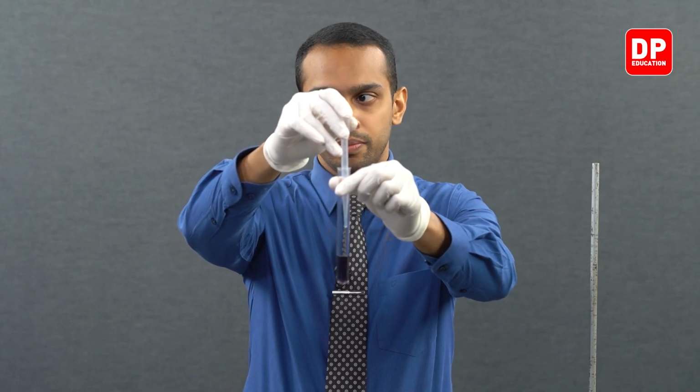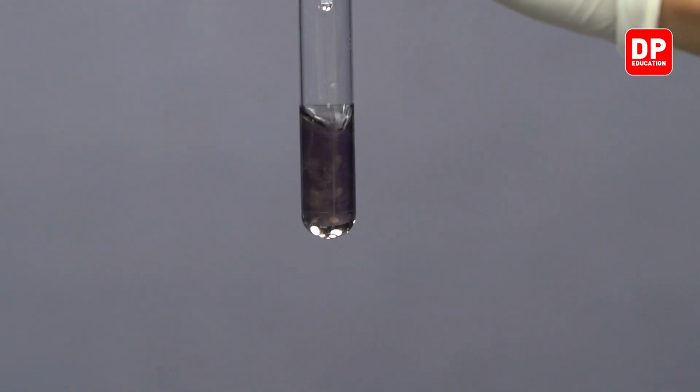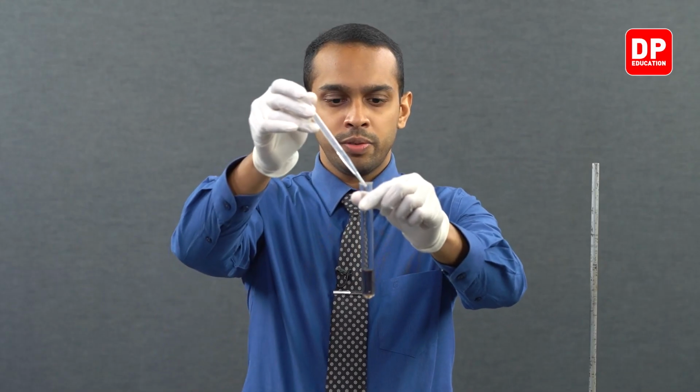Observe what happens when hydrochloric acid is added. What happens to the color? What is your observation?